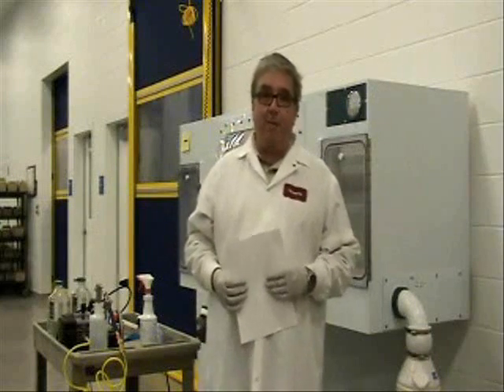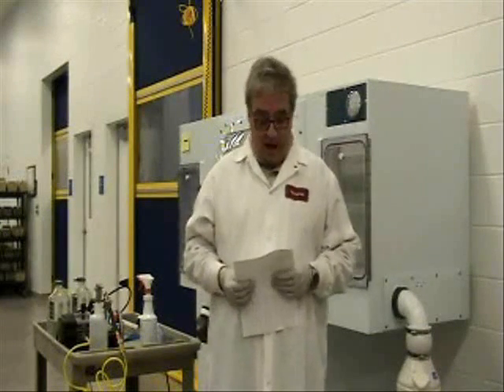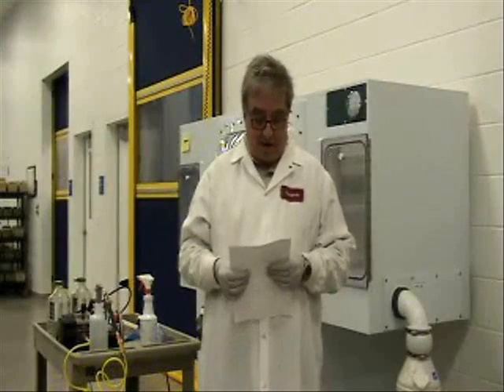Good afternoon. I'm Frank Razzamoni of Park Bioservices. I'm here today to talk about sterilizing a semi-rigid isolator. I need to point out some of the differences of sterilizing a semi-rigid versus a flexible film isolator.